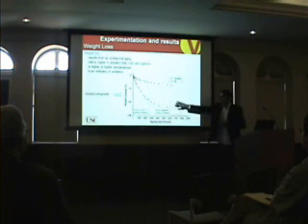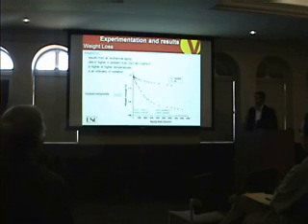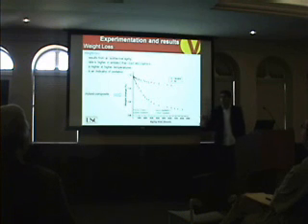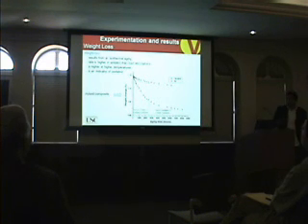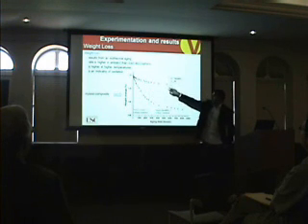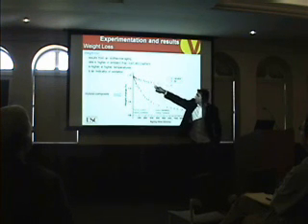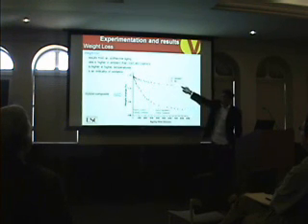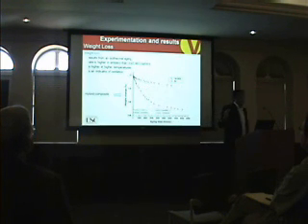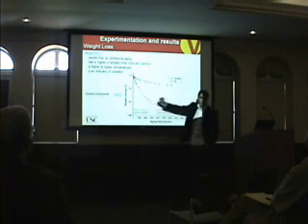This is the weight loss of our actual composite material over time, and it's up to almost 2 years or something like that. We put the sample in an oven at 100 degrees C, 180 degrees C, and 200 degrees C, and recorded the weight loss over 2 years. As you see, this is for the composite in vacuum, and this is in an air circulated oven. You have the weight loss due to thermal degradation of your epoxy. But this is due to the thermal degradation and also thermal oxidation of your material. And the difference is almost because of the oxidation of your matrix.